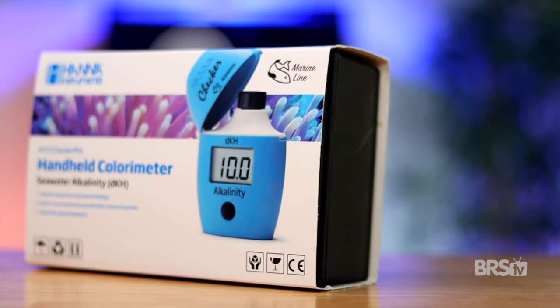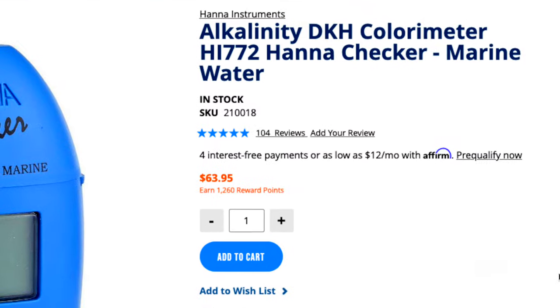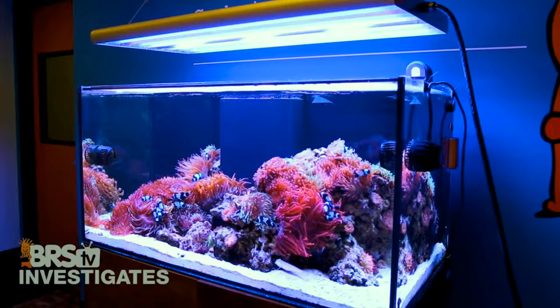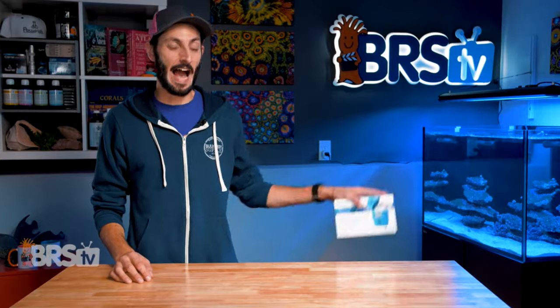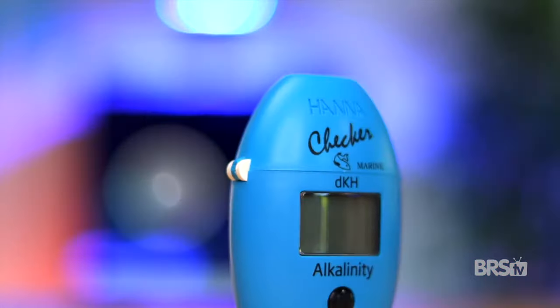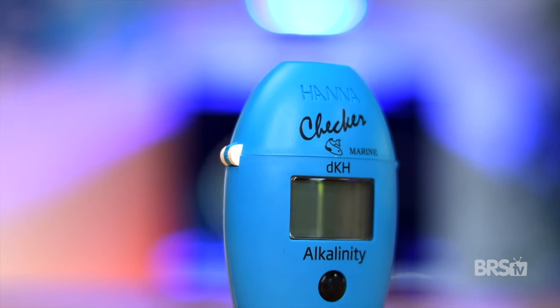I've never met anybody who used the Hanna Alkalinity Checker and then went back to another test kit. There's a reason why it has over 100 five-star reviews, that BRS uses it in all of their tanks, that Thomas loves it, and that I've used this checker here for over five years. It's because it's the easiest, fastest, and most accurate hobby-level test kit available, and it's a great value.